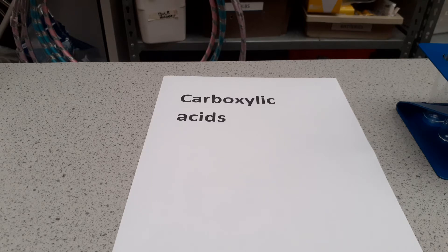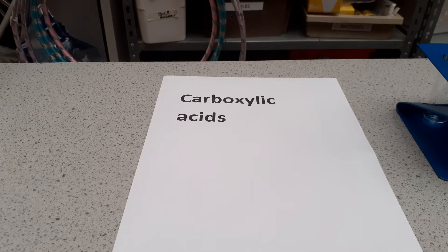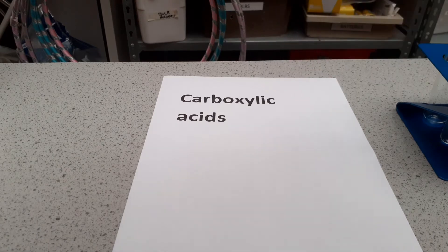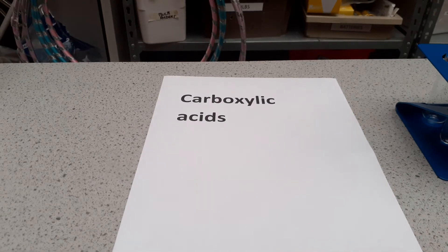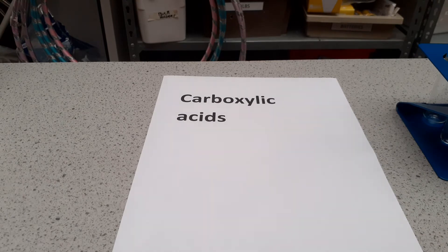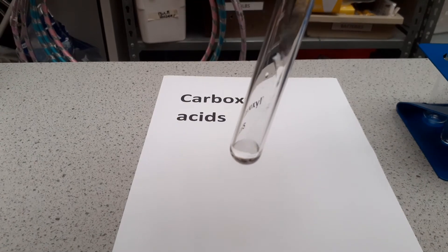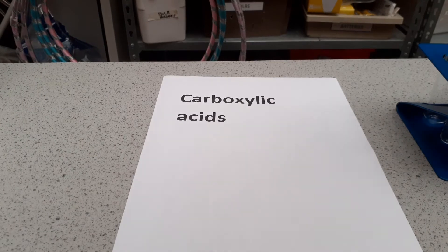Carboxylic acids are in topic 7, organic chemistry. We're going to look at the reactions of carboxylic acid and compare them with hydrochloric acid. The carboxylic acid I'm going to use is ethanoic acid. I have three test tubes of each — both acids are one molar, so they're the same concentration. We try to use the same amount of each so we can compare the speed of the reactions.